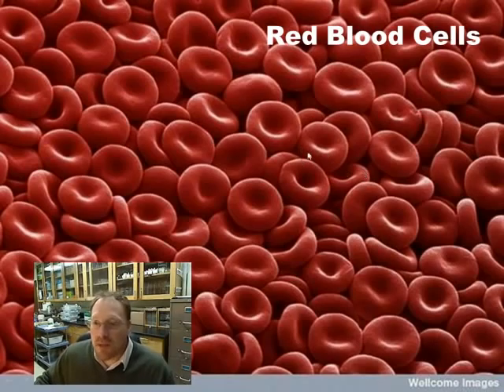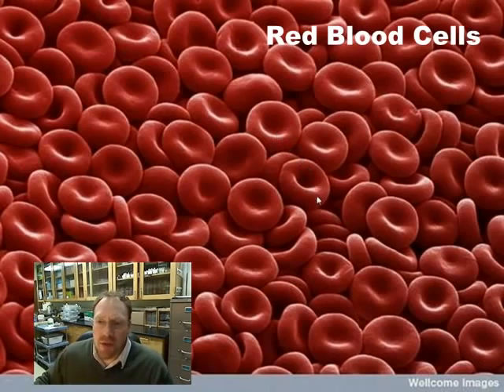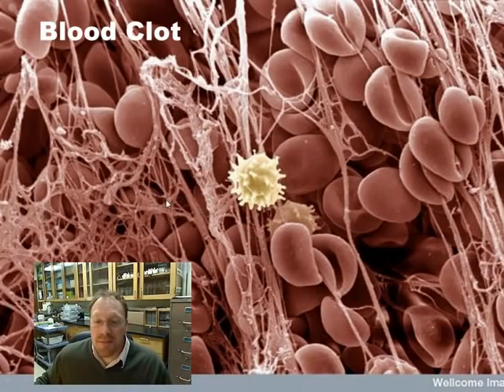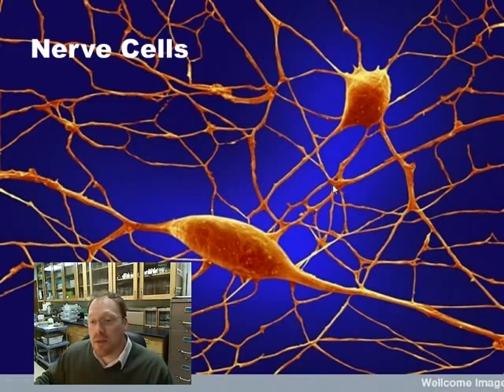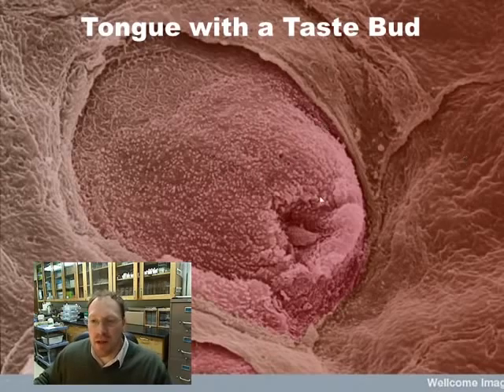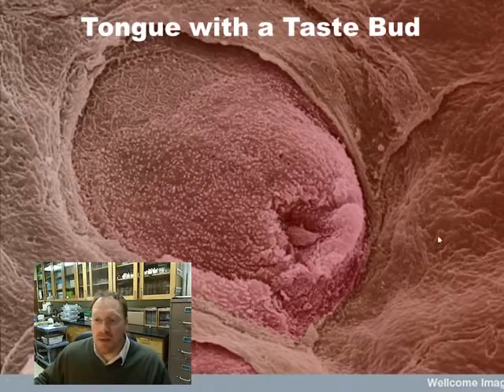This is a scanning electron microscope image of red blood cells — beautiful, almost donut-shaped objects. Here red blood cells are trapped in clotting factor protein, showing the beginning of a blood clot. These are nerve cells: the body of the cell and the long tube-like structures — the axons or dendrites — the endings of your nerve cells along which electrical impulses travel. This is a taste bud within a section of the tongue; this is what your taste buds look like on the surface.